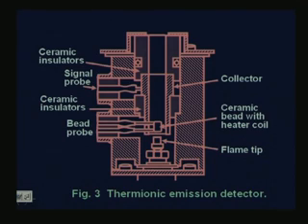Okay. So, any traces of phosphorus, any traces of nitrogen can be better detected in the case of the thermionic emission detector compared to the flame ionization detector, though the flame ionization detector is also comparatively new compared to the thermal conductivity detector. The minimum detectable limit is around 0.06 pg per second for nitrogen.